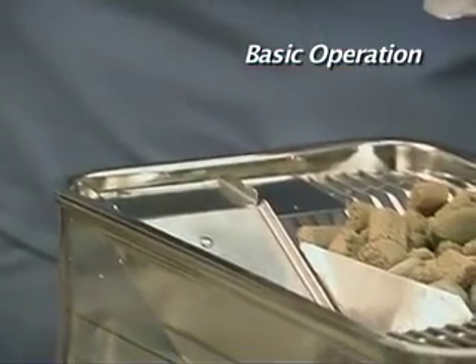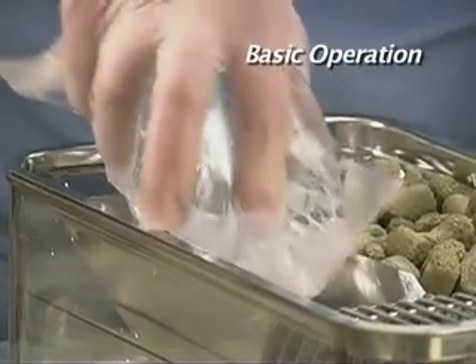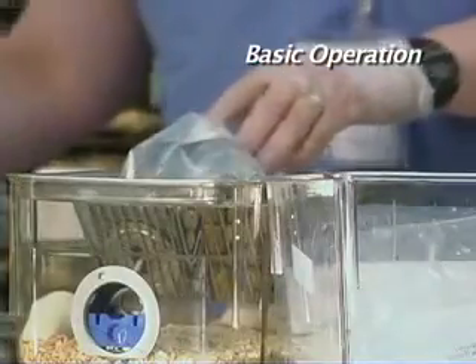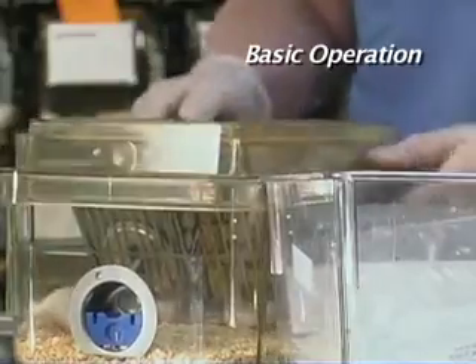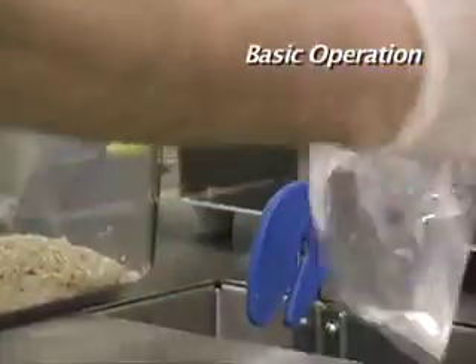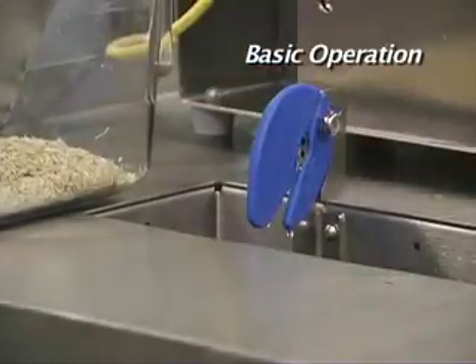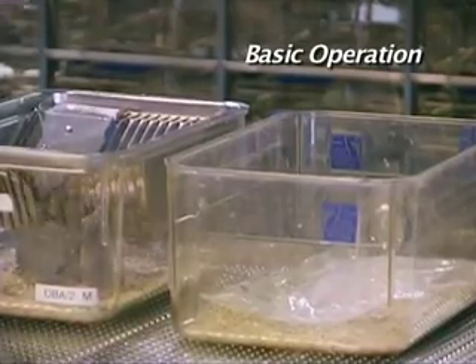The Sippersack can now be inserted valve side down in the supplied liner of the wire bar lid, just as you would a water bottle. This process can be repeated with each animal cage change. The empty Sippersacks can be disposed directly into the Edstrom Sippersack disposal cart or tossed in the dirty cage for disposal later.